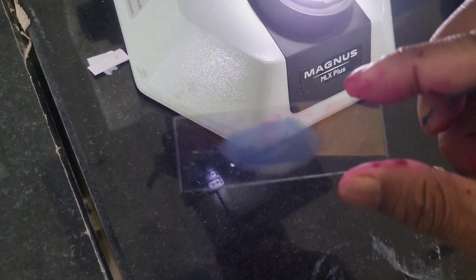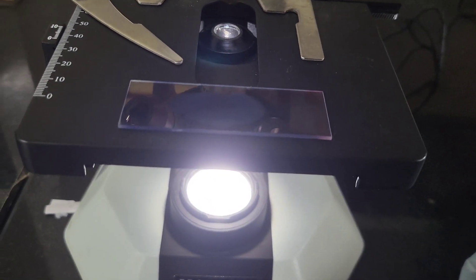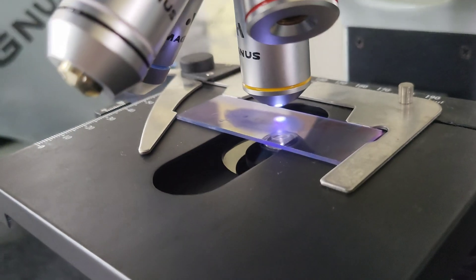How many fields are observed before declaring a slide is negative? At least 100 to 300 fields. Can Ziehl staining differentiate between species of mycobacterium? No. Mycobacterium leprae better detected using modified Ziehl stain or Fite-Faraco stain.